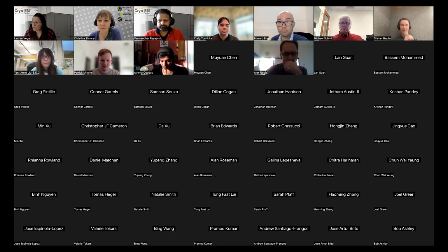It'll generate commands. Something that I think has been on the development list for a while is to maybe actually also build a standalone GUI for Topaz, possibly as a Napari plugin or something like that. But unfortunately, we don't have anything like that right now.